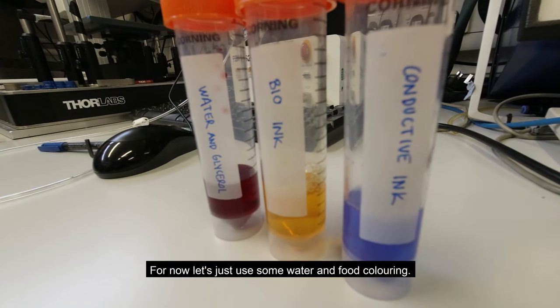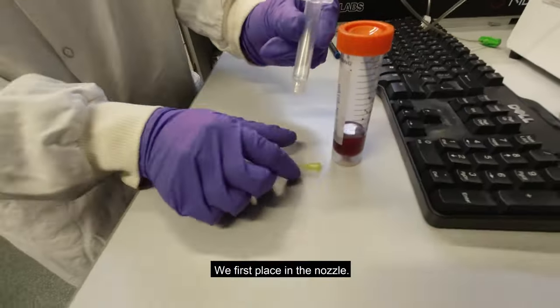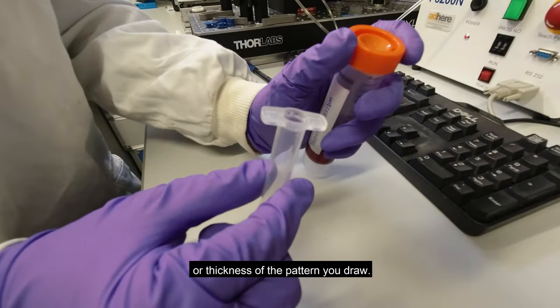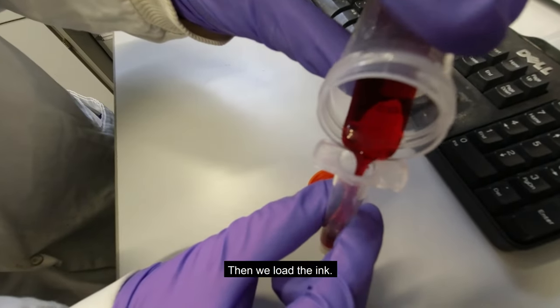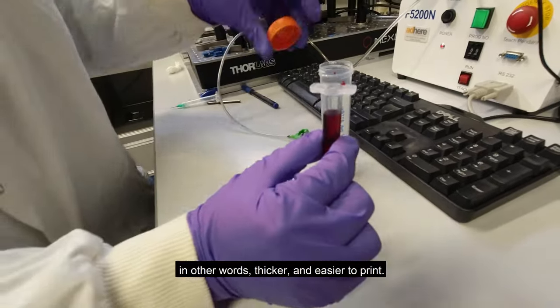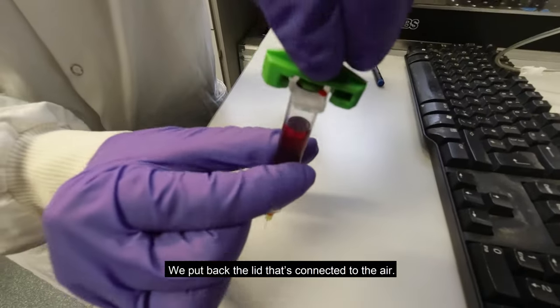For now, let's just use some water and food coloring. This is normally used as a control ink. We first place a nozzle. Different sizes of nozzles give you different volumes or thickness of the pattern you draw. Then we load the ink. The ink has glycerol to make it more viscous, in other words, thicker and easier to print.